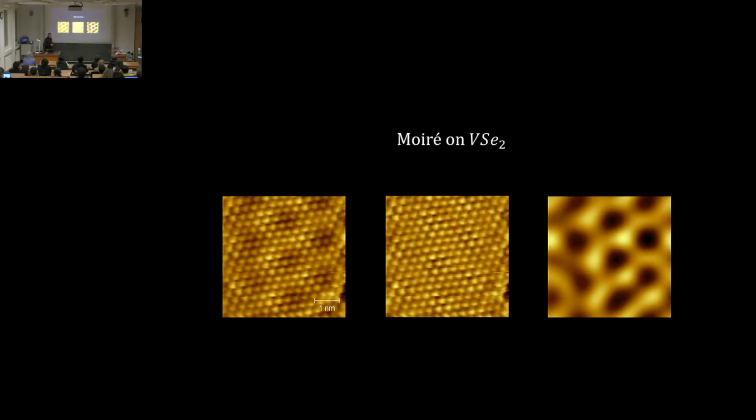And so now you may say, okay, we have seen a lot of drawings, but what do we really see? And so I can show you this type of images that I had the pleasure to take with Ishita when I did an internship in the group of Christoph this summer. So here you can see a moire. So what is a moire?